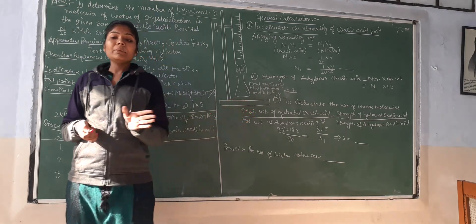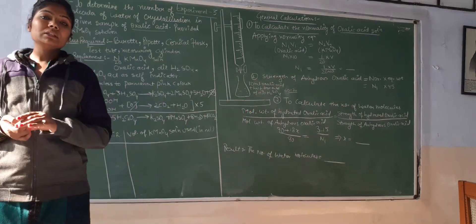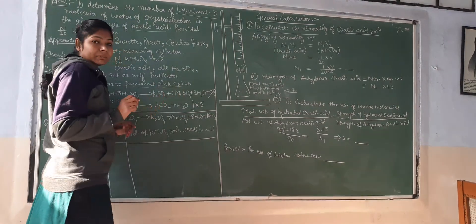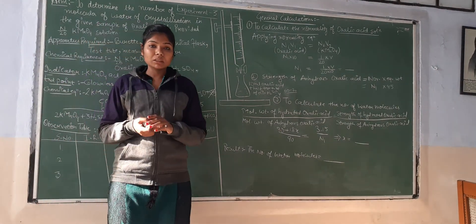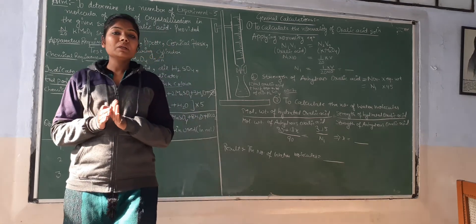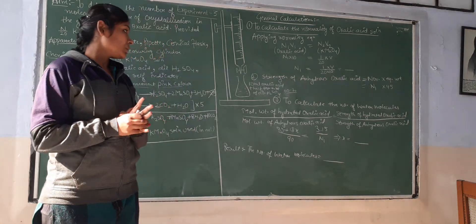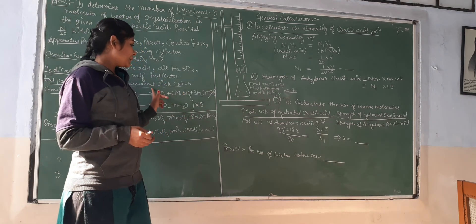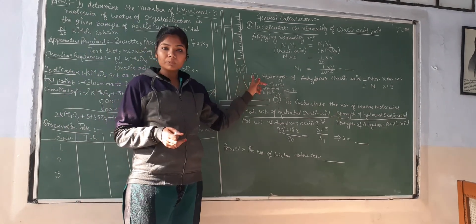We have a colorless solution. We will do KMnO4 addition. When pink color comes at the start, shake. If the color disappears, that means we need to add more KMnO4.